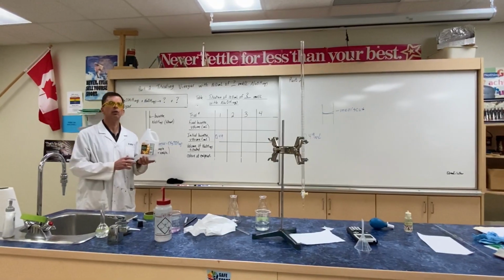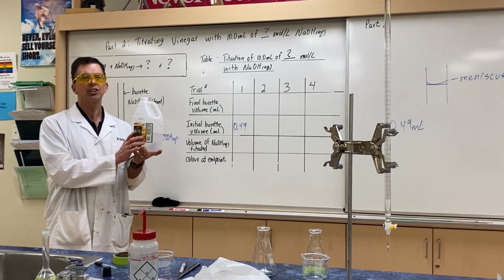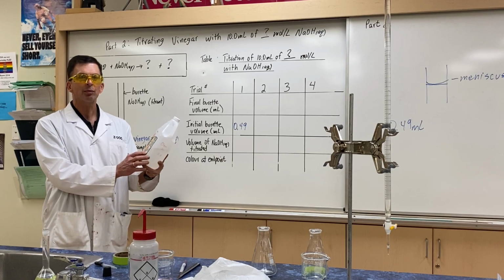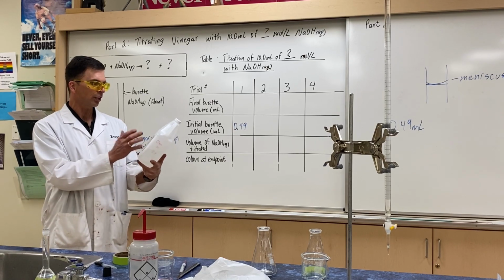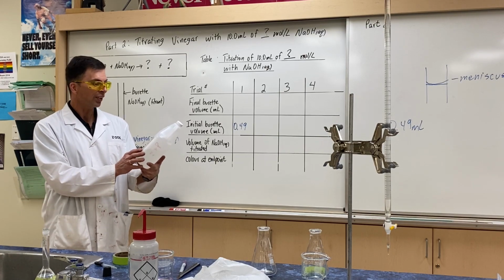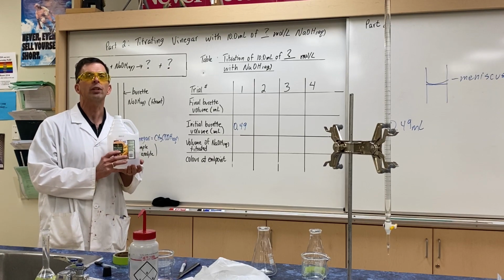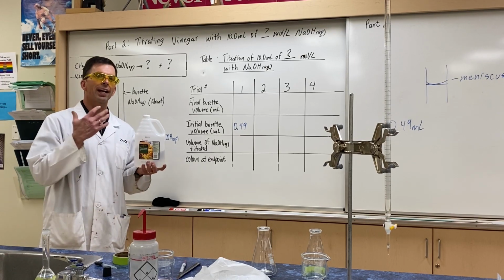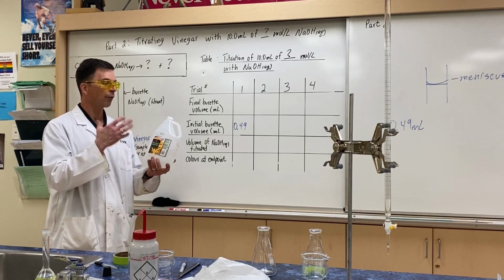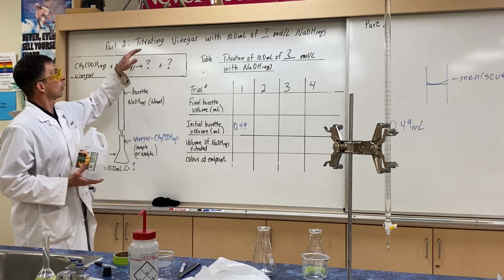Okay, so we're back here with part 2. Your goal is to test the manufacturer's claim. Co-op Gold Vinegar states on the label that the amount concentration or percent concentration is 5%. In chemistry, that would translate to 0.83 moles per liter. So titration is an analytical chemistry skill that can be used for testing consumer product claims like this. So we're off to part 2.